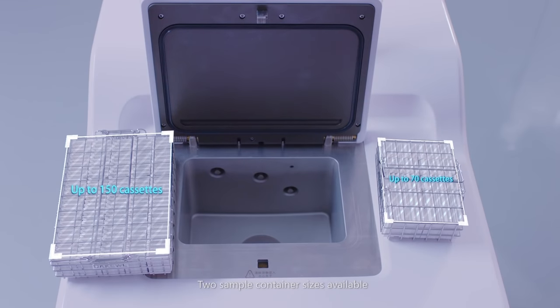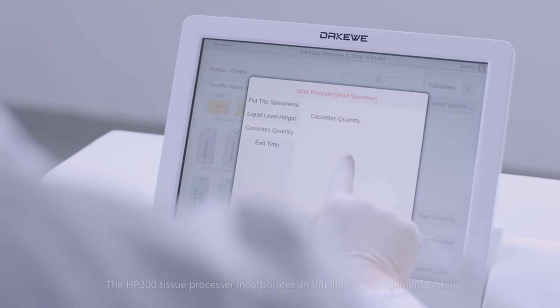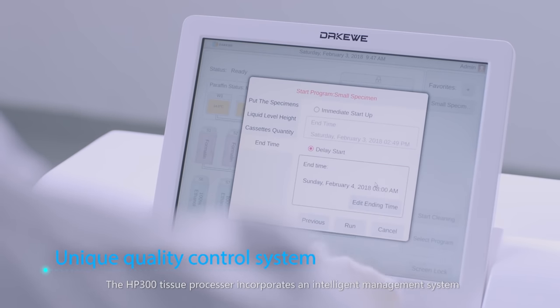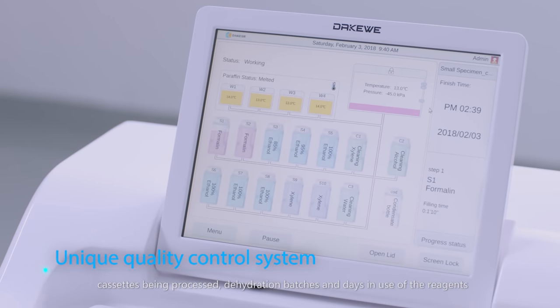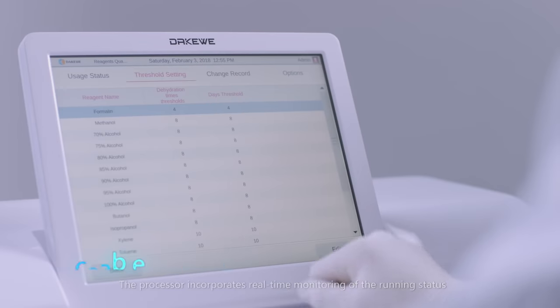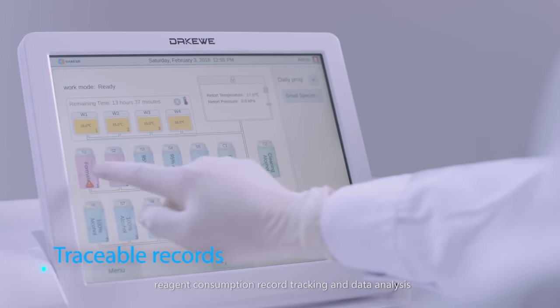Two sample container sizes are available. The HP300 Tissue Processor incorporates an intelligent management system. Its consistent dehydration is safeguarded by the monitoring parameters for the qualities, cassettes being processed, dehydration batches and days in use of the reagents. The processor incorporates real-time monitoring of the running status, reagent consumption record tracking and data analysis.